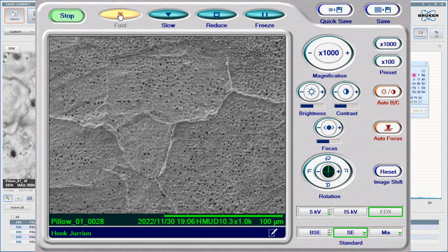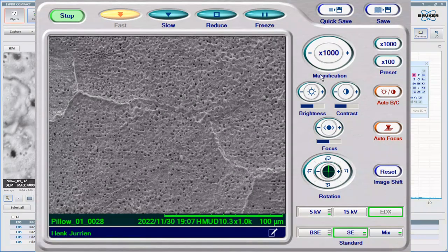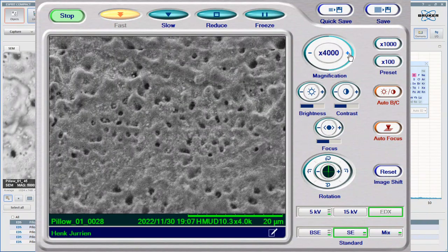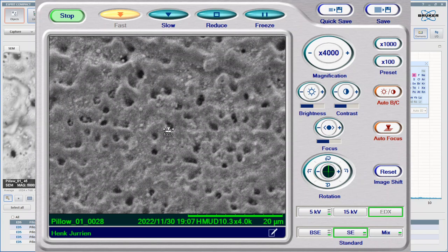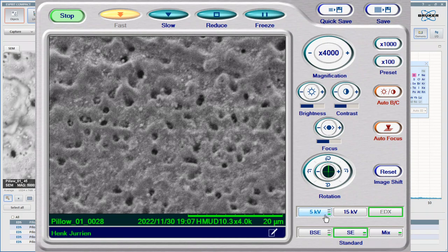And when we go across and look at various areas of these, and we go down further and zoom in, you'll see there are a plethora of these things, and in the center of them, they often have something in the center, and often it looks like it's a different material or a different constitution of material. Okay, now are these toroids that are forming a semi-regular array, as we saw on the Hutchison fracture sample and as we saw on the Lion dual sample? That is the question. It certainly looks like it may be that kind of thing going on.